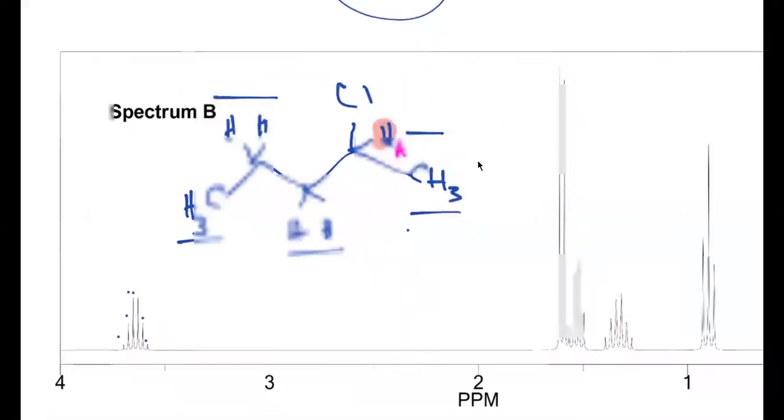What about this signal right here? We're going to call it B. I have a question right quick. Go ahead. About the last one, is that hydrogen on an sp3 hybridized carbon? And if it is, does that have anything to do with the splitting pattern? It is on an sp3. I mean, not specifically sp3, but a chiral center.